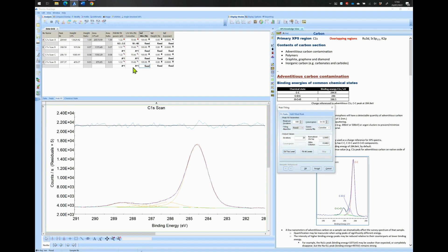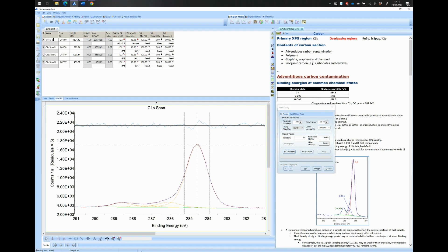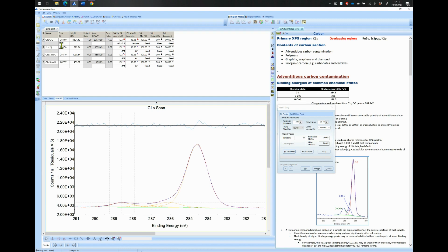Let's label the four peaks. As per the knowledge view, the peak close to 284.8 eV is labeled as the C-C bond. Write C-C bond next to the C1S of peak A. The peak close to 288.5 is attributed to carbonate bond or OC double bond O peak and can be labeled as such next to the C1S of peak B.